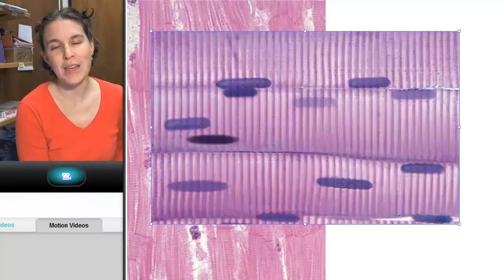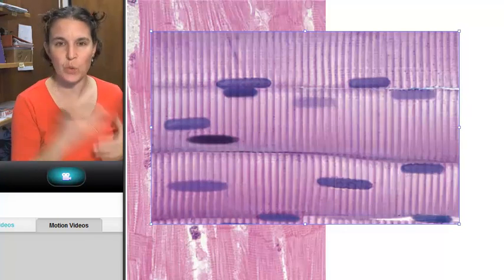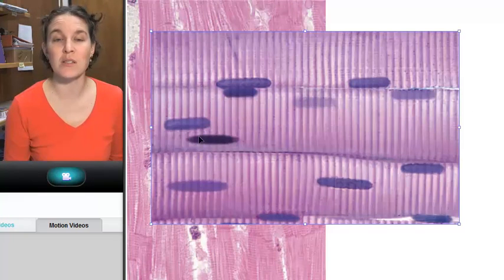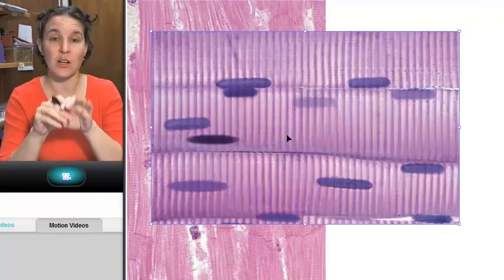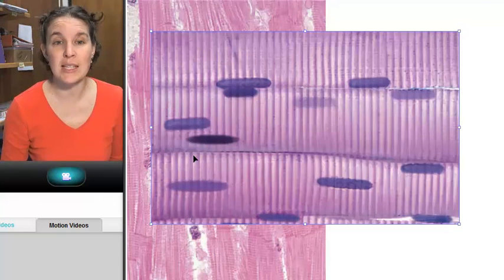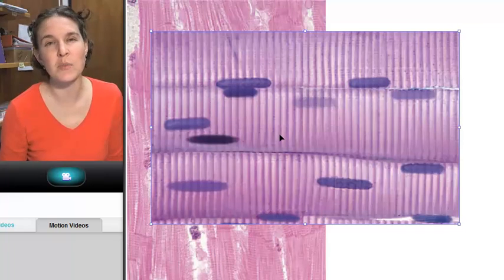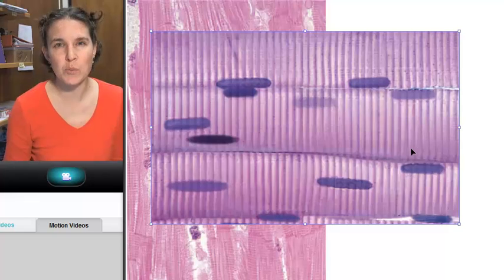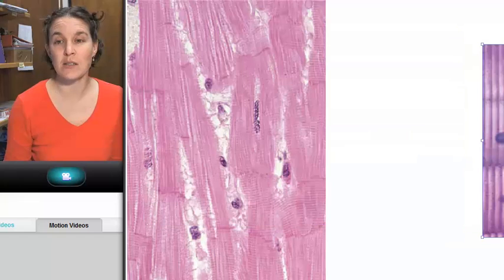I have a chunk of skeletal muscle here for you to look at just to remind yourself of the characteristics of skeletal muscle. You remember that skeletal muscles are very long tubular fibers, myofibers. This single muscle cell is this long tube. Skeletal muscle is striated, hence the stripes that you see, and has multiple nuclei in it. Now, I'm going to get rid of this piece of skeletal muscle cell.